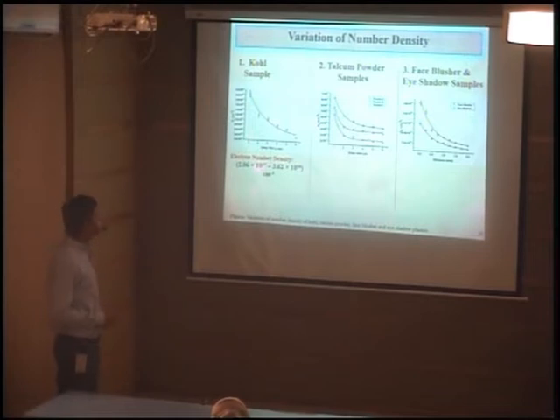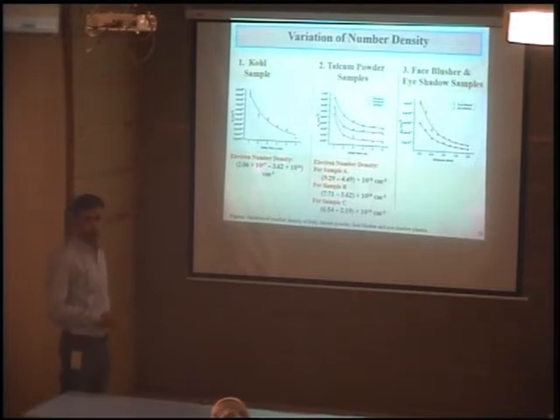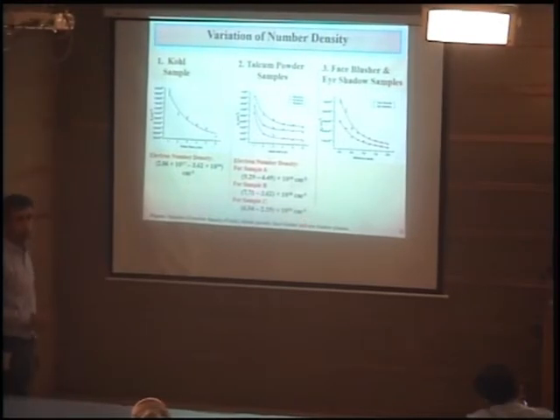While for talcum powder sample A, electron number density varies from 9.29 to 4.49 × 10^16 cm^-3. For sample B, it varies from 7.71 to 3.62 × 10^16 cm^-3, and for sample C it varies from 6.54 to 2.19 × 10^16 cm^-3.